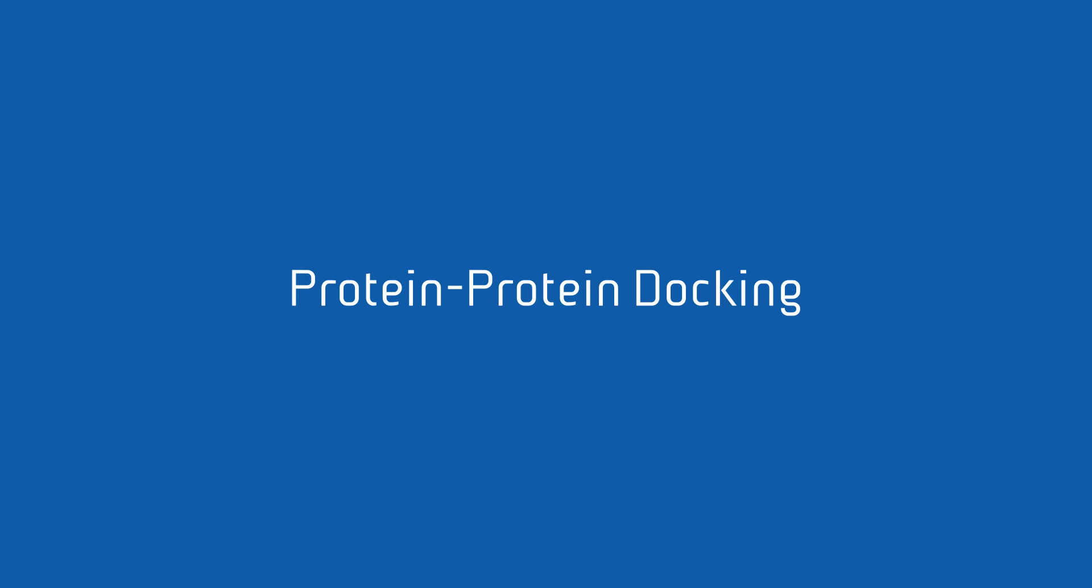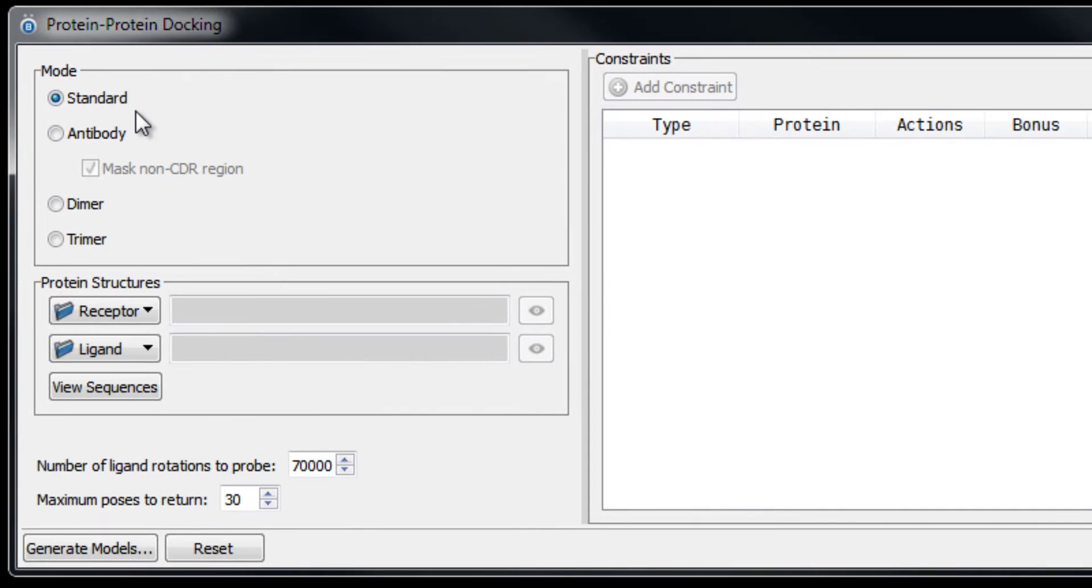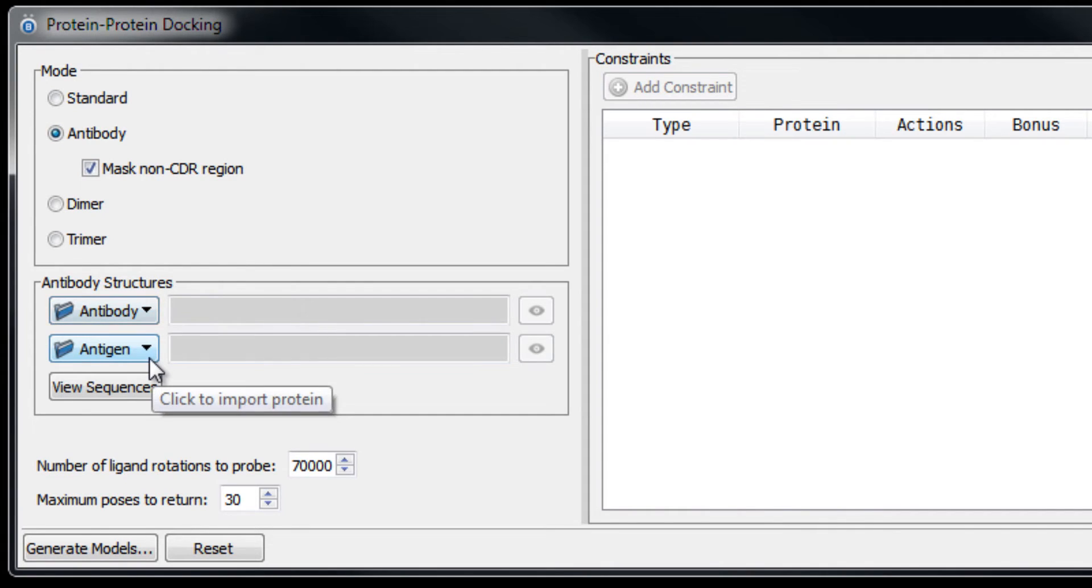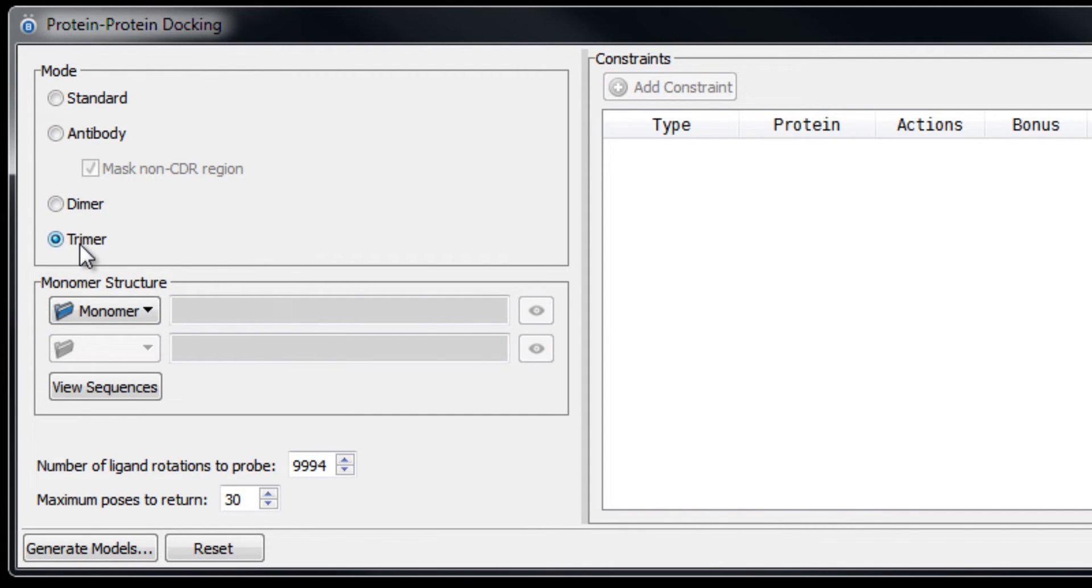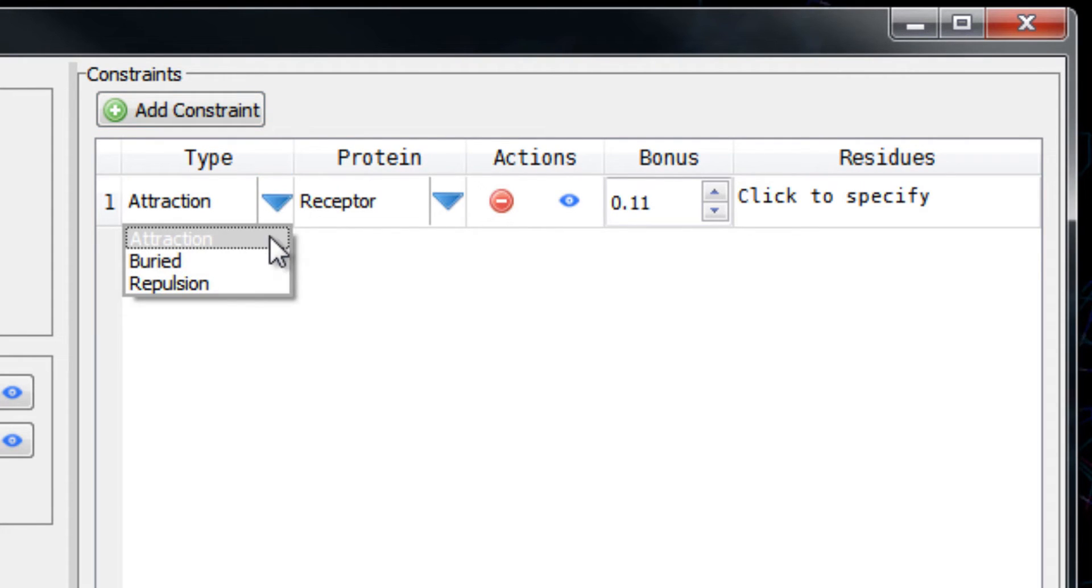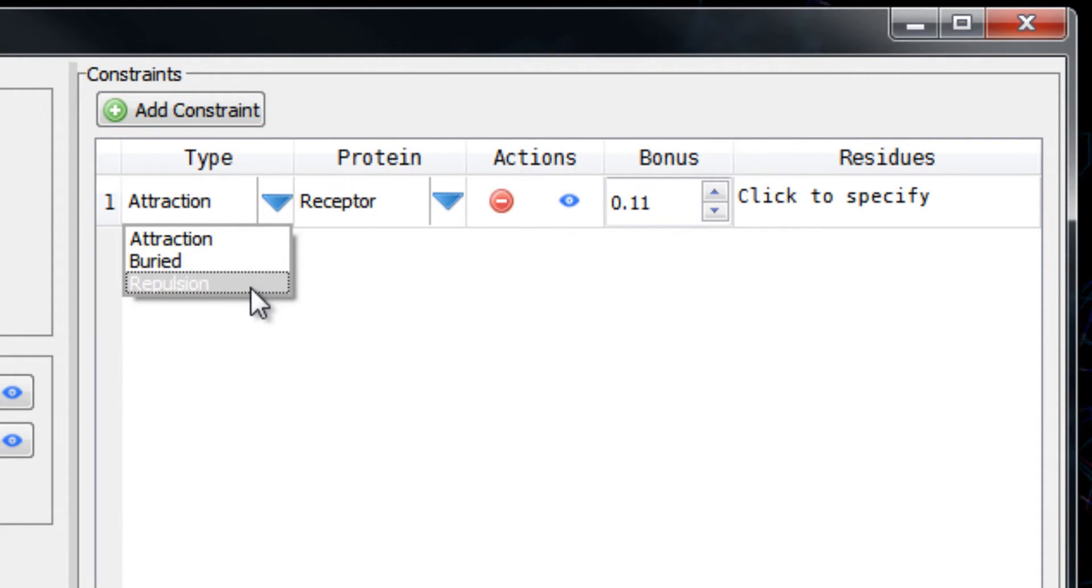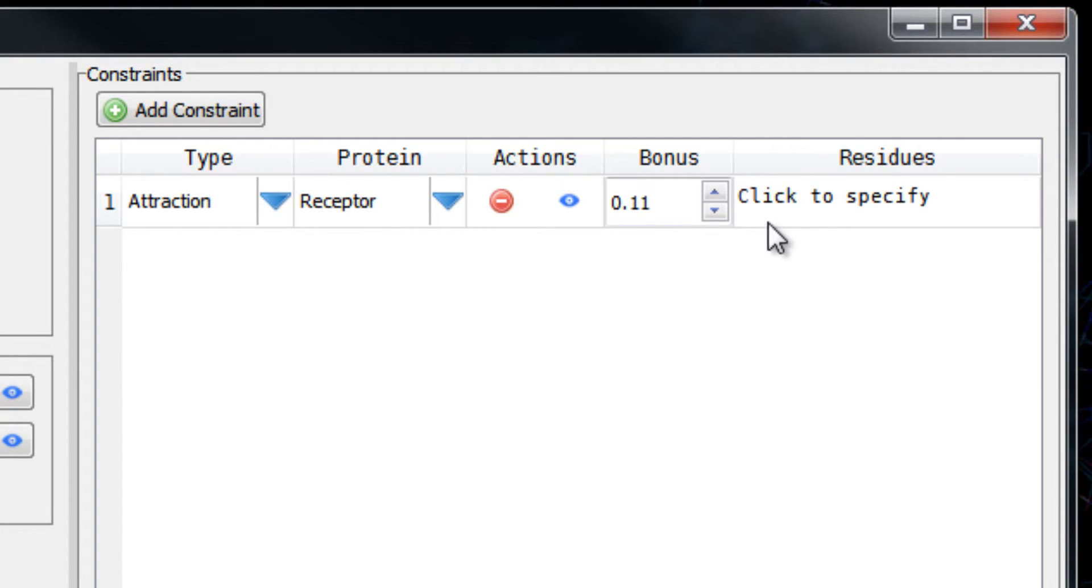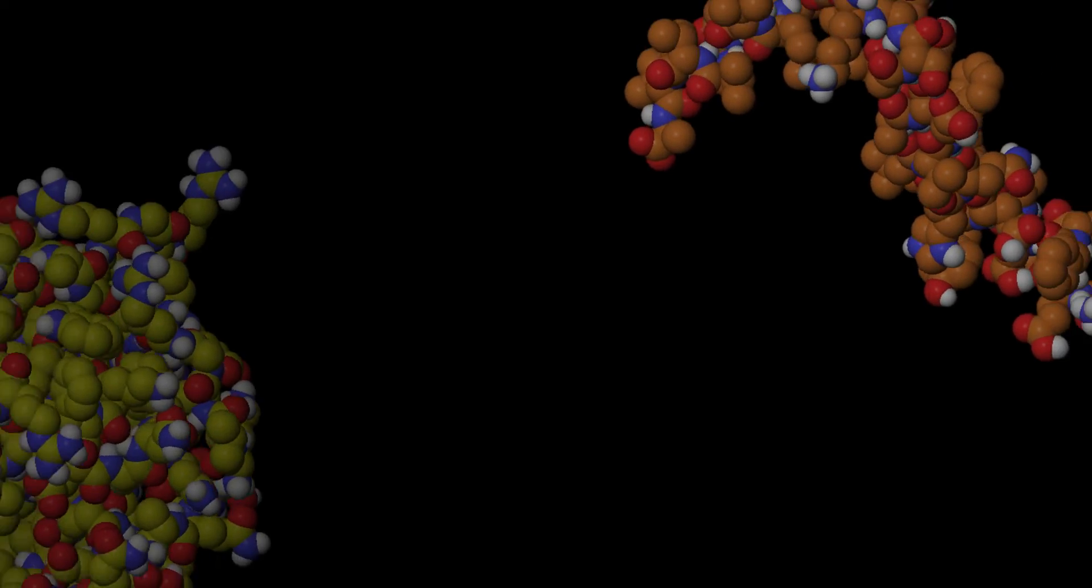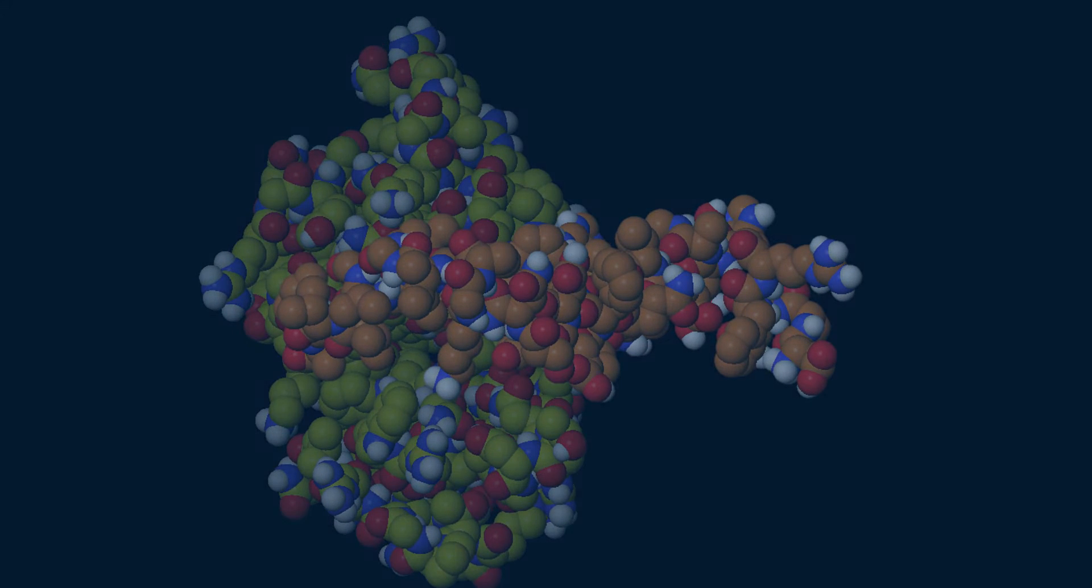BioLuminate offers a state-of-the-art protein-protein docking program with a standard mode for two proteins, receptor and ligand, modes specific to antibodies for antibody-antigen docking, and modes for multimers, dimer, and trimer, with options for constraints such as attraction, buried, or repulsion, and apply them to specific residues for more accurate results.